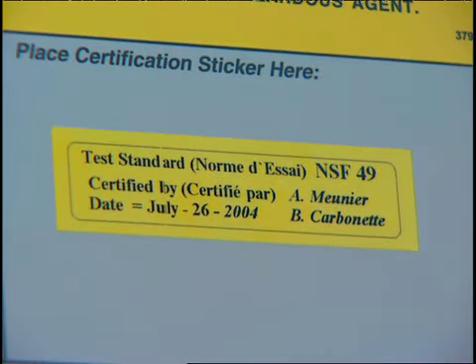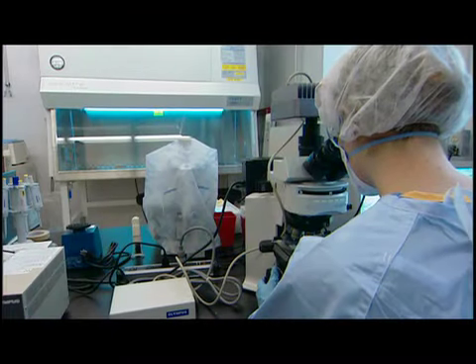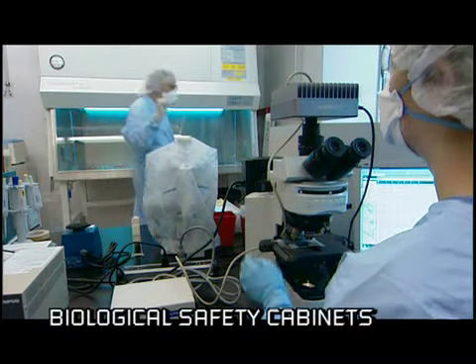Aside from your personal protective equipment, your primary protection in a Containment Level 3 lab is offered by the BSC. Each BSC must be professionally checked once a year. Due to their importance, we will take the time to go over their operational procedures in detail. The first step is setting up the BSC.